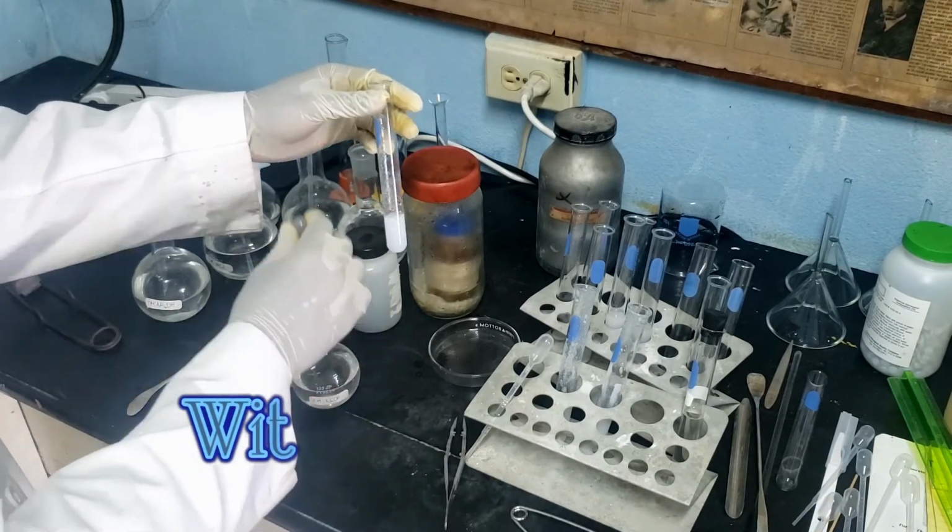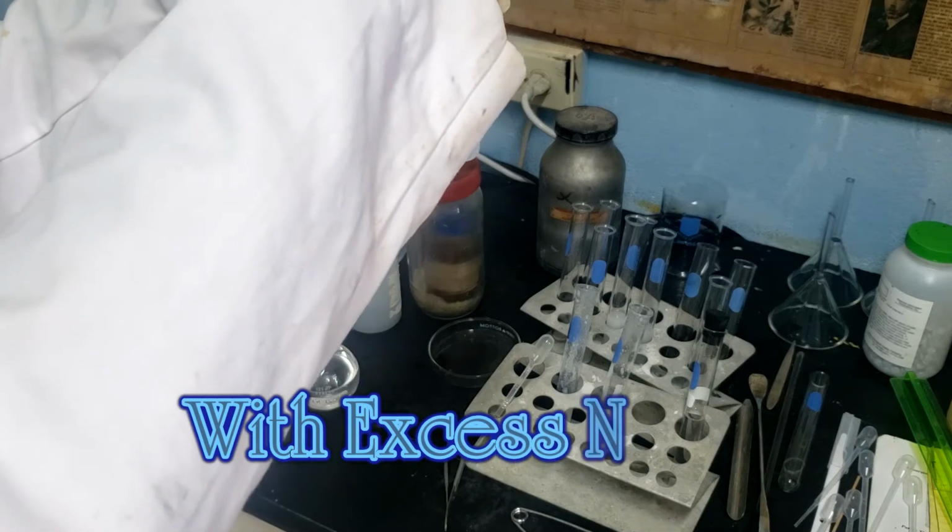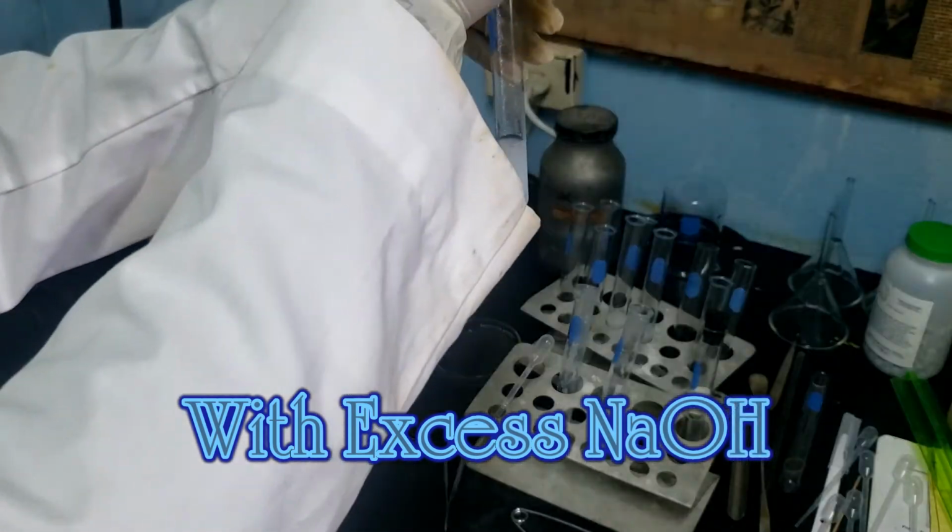In Tube 1, we explore how the white precipitate of aluminum hydroxide is dissolved by adding sodium hydroxide.